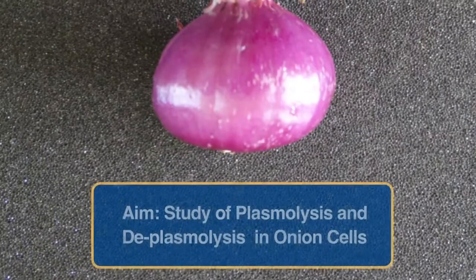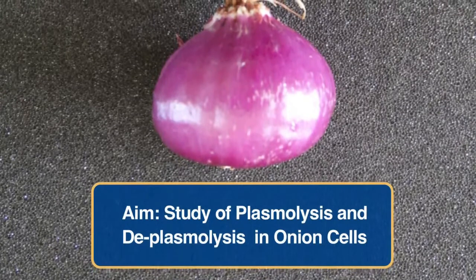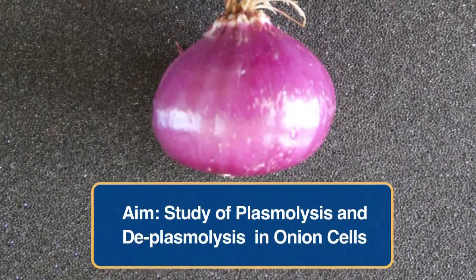Hello students, the title of today's laboratory module is Study of Plasmolysis and Deplasmolysis. The aim of today's experiment is to study plasmolysis and deplasmolysis in onion cells.